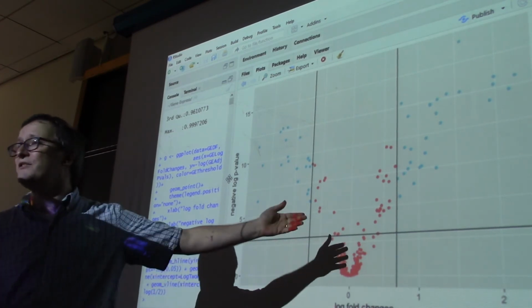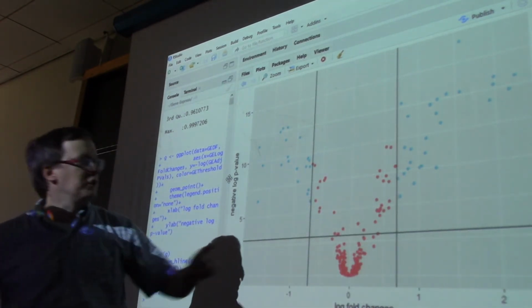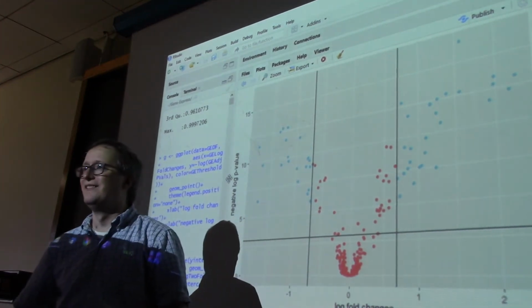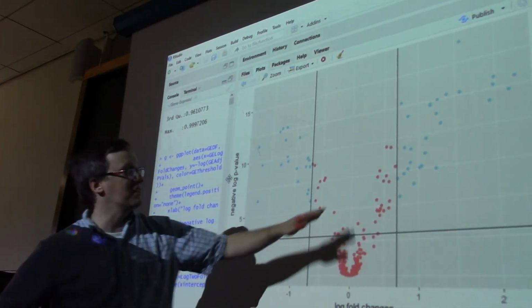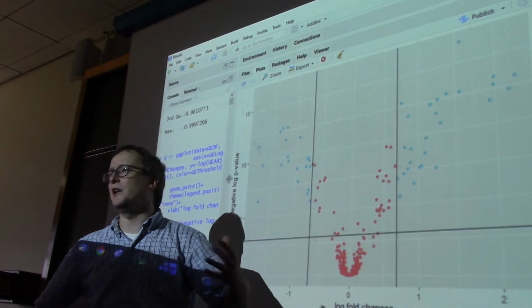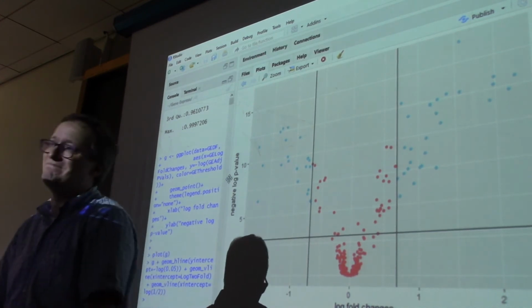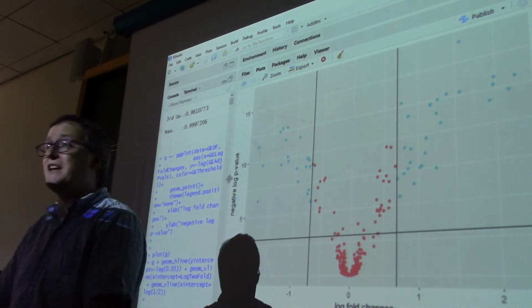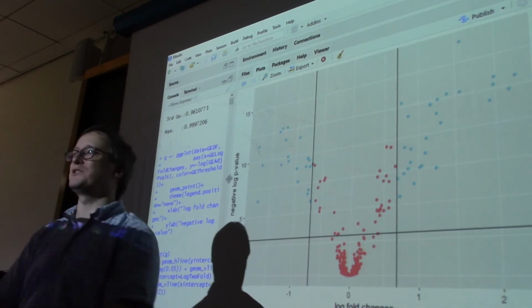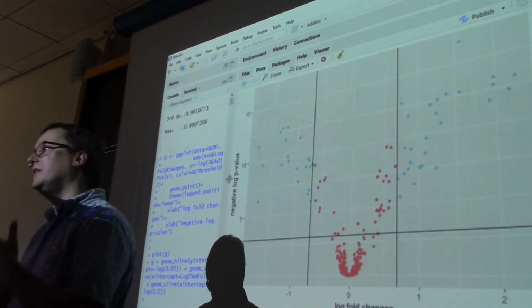In this case, we didn't even tell the software, we want these to be red and these to be blue. We told it that these are trues and these are false. You figure out what they should be colored, which is a little strange. So this is a default palette, we would call it. This is the set of colors that it uses when given a two-way classification of points. Might that change in a later version of ggplot2? Sure. Maybe the next version of this software will make these purple and these red. I don't know.